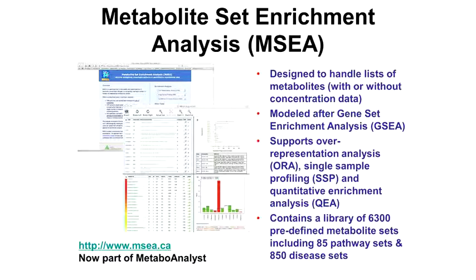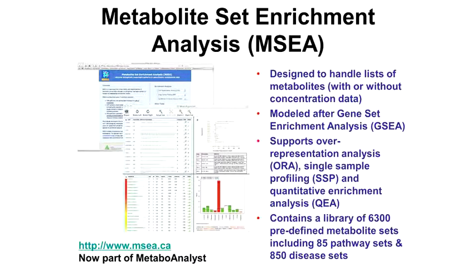About five or six years ago, we compiled a list of metabolite sets, grouped into a variety of disease sets as well as pathway sets. Originally, metabolite set enrichment analysis was a standalone program — I think it's still active, you can go straight to MSEA — but we've integrated it into MetaboAnalyst, so it uses some of the better, newer features that are now with the R modules.